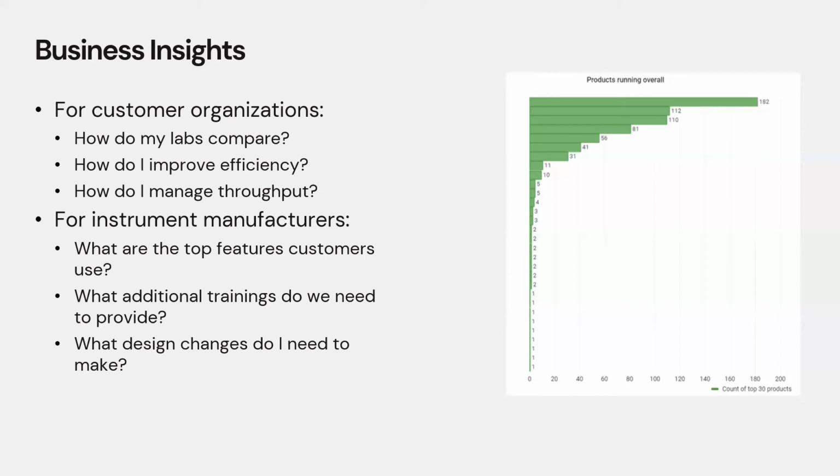Are those due to technicians who don't quite know how to use the instruments or some features, or are those due to components not well designed? By understanding all those questions, the manufacturer can improve the instruments in the next generation design. They can improve their training and their menus, and therefore provide better services and higher quality products to their customers.